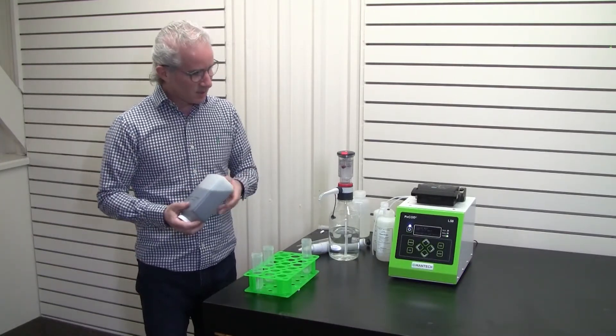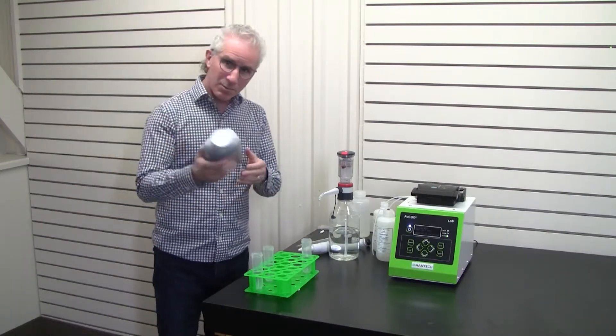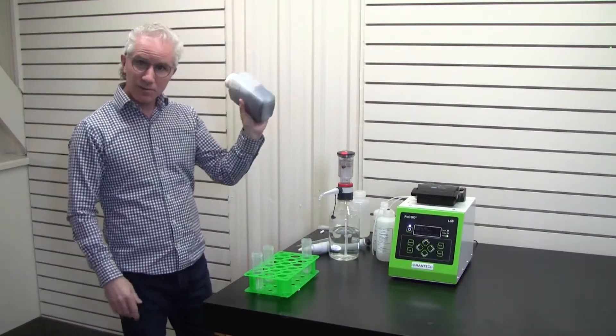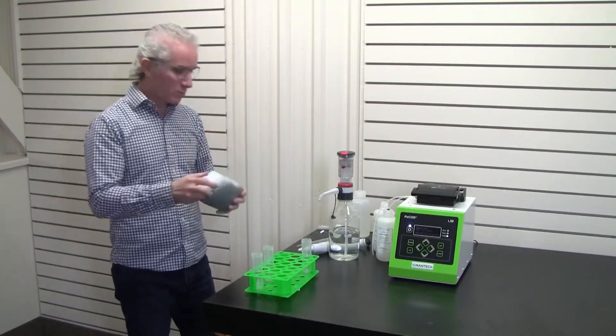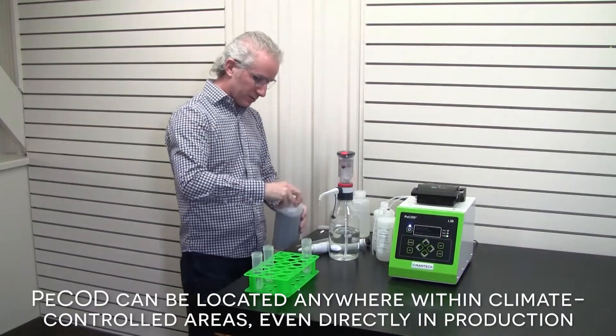We'll run this in the green range, which can go up to 150 milligrams per liter. Here's a sample that came in from the plant or the field — you just want to do a little bit of shaking to make sure it's homogeneous. Of course, since it's dirty, we're going to do a pre-filtration step.